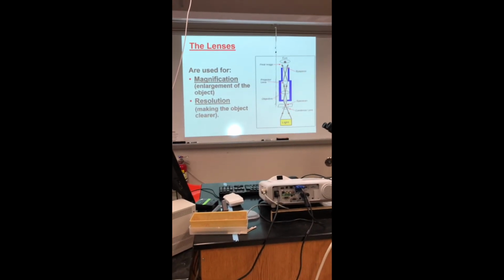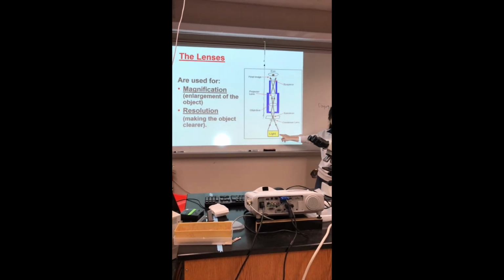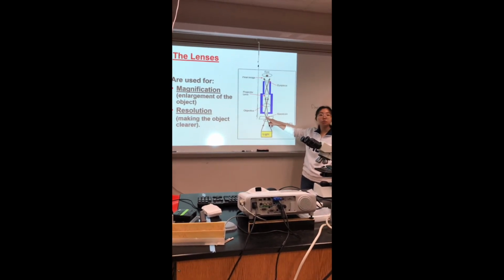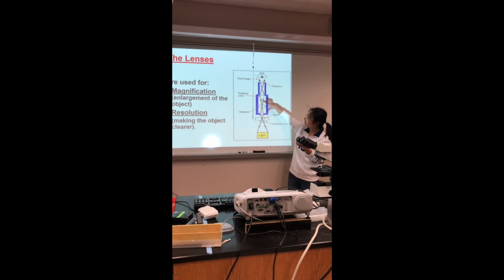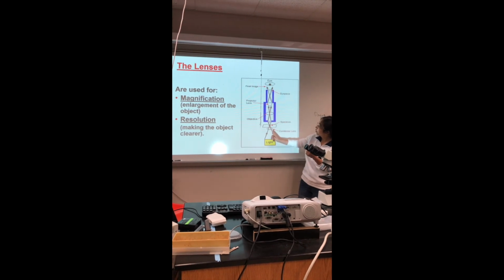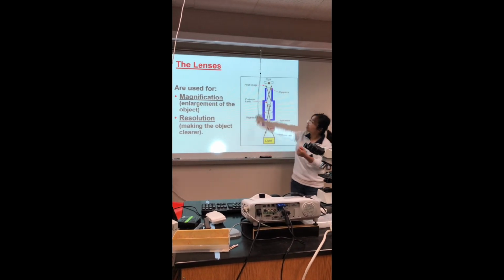What do you mean by magnification and resolution? Make sure you understand this concept, and this is pretty interesting. The light housing provides you the light, it goes to the condenser lens, and goes through your specimen. Your specimen is supposed to be a very thin layer that will not block the light from penetrating through. You have your objective lenses and you have your ocular lenses. When you see the final image, it's reversed and inverted.